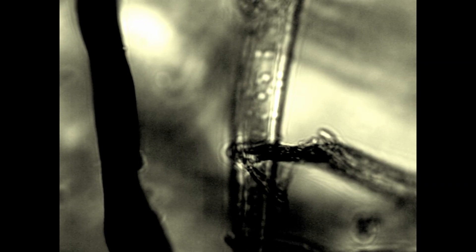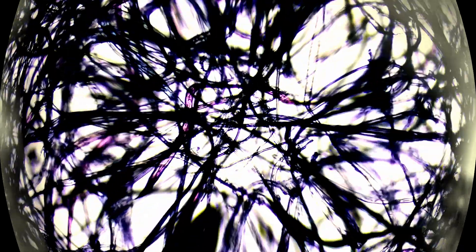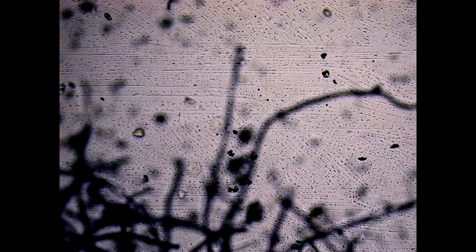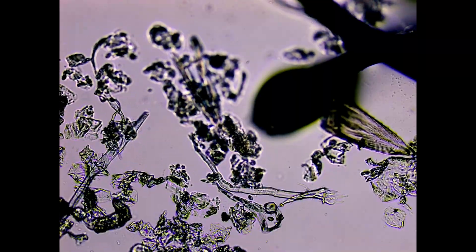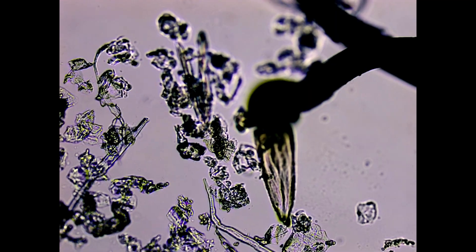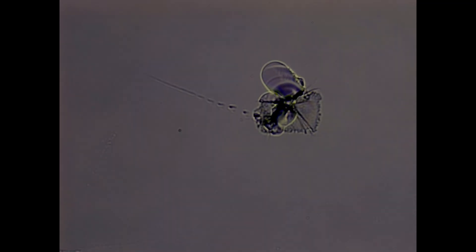Under my microscope, the scale becomes real. Each of these specks, bacteria clinging to filter threads. They are alive, swarming, and without a filter, they are floating through your home.